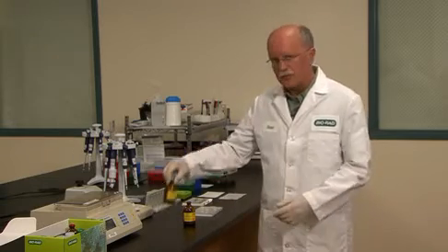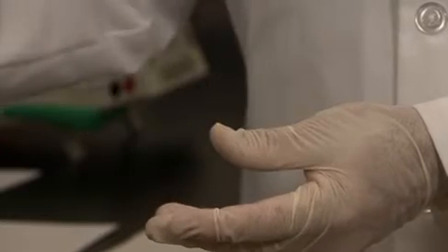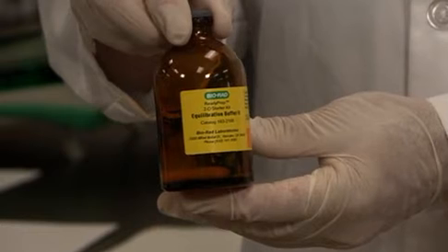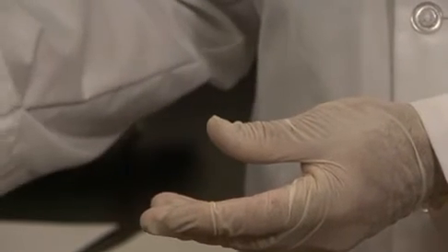The steps following rehydration and focusing of the IPG strip are equilibration of the IPG strip in preparation for the second dimension gel. The equilibration process is a two-step procedure. Equilibration buffer number one contains DTT for reduction of proteins. Equilibration buffer number two contains iodoacetamide for alkylation of proteins. Each solution contains SDS for denaturation of proteins to ensure optimal performance in the second dimension.